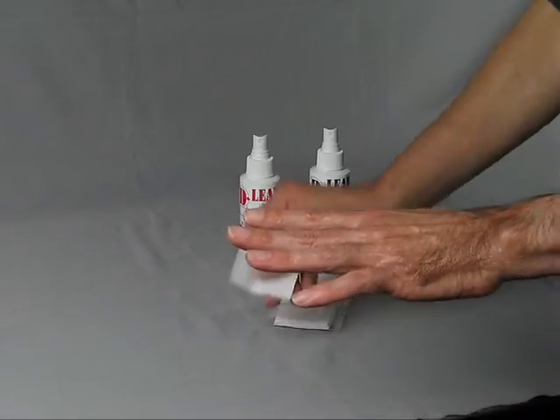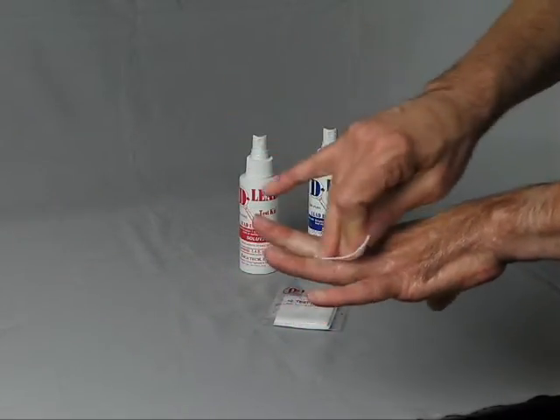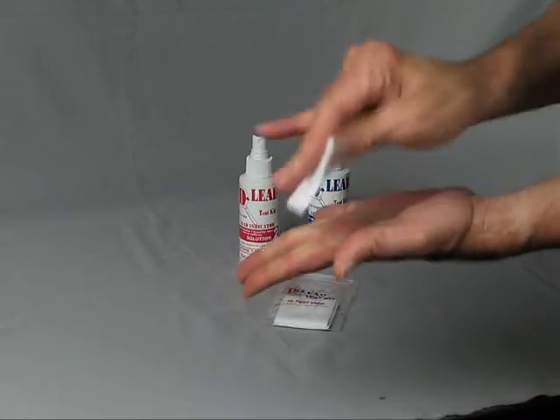Take a new test pad and wipe both sides of the hand thoroughly, getting in between the fingers. Make sure to soak up all the liquid on your hand entirely.